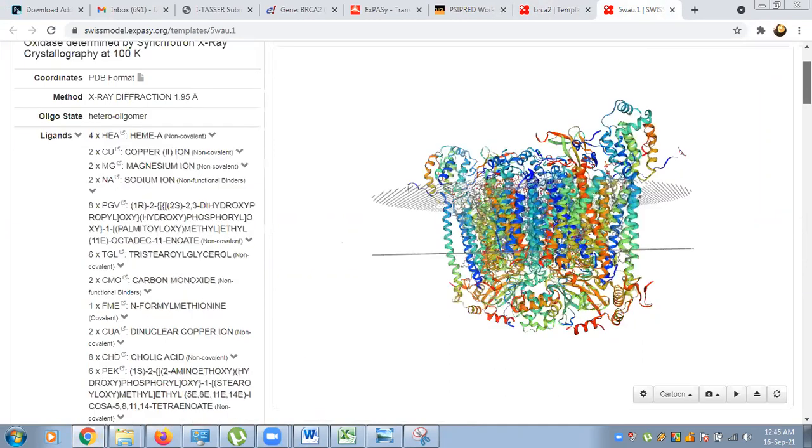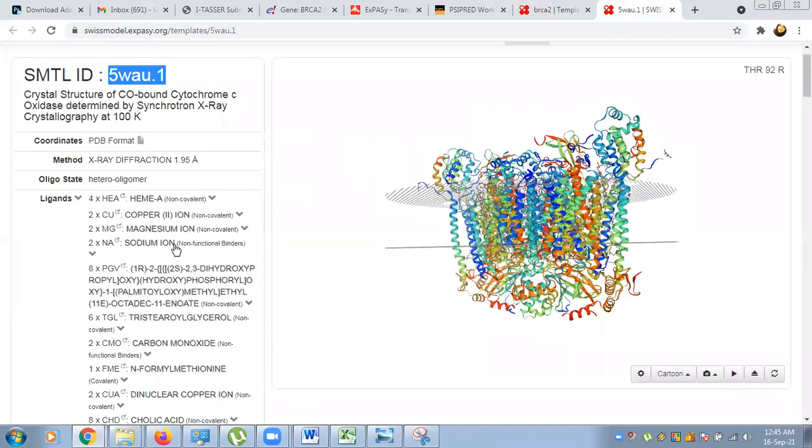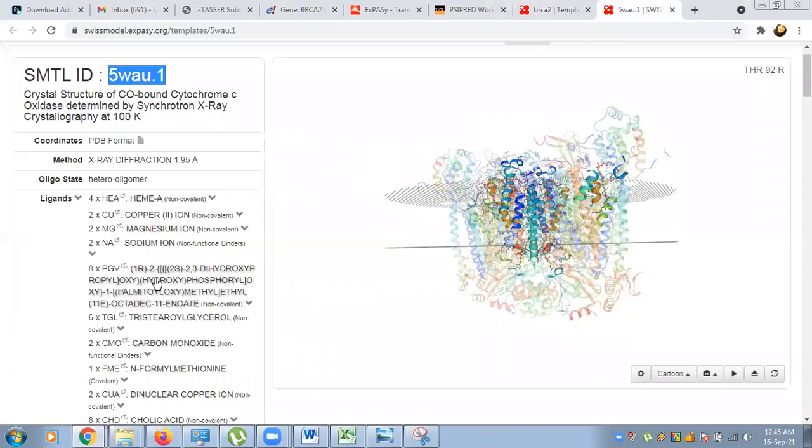Here also you can select a particular ligand or just place your cursor on a particular ligand. So in the image, you can see that portion will be highlighted or a bit more apparent. See, the whole protein is a bit blurred and a particular portion is apparent.